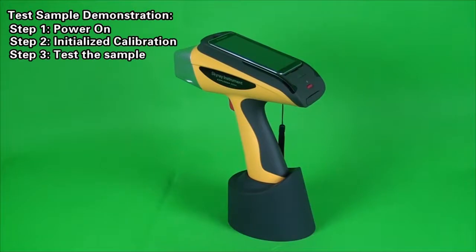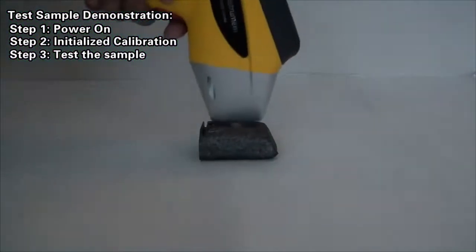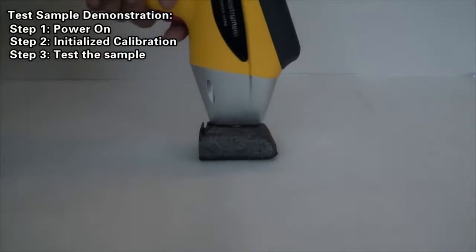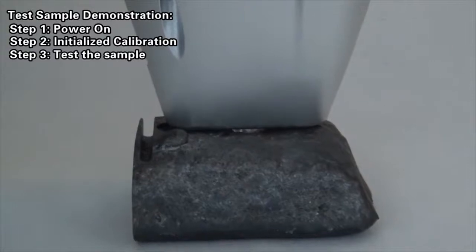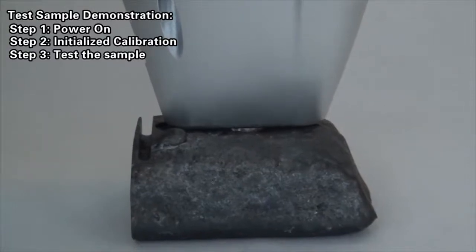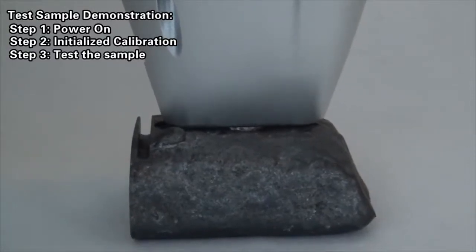Step 3: Test the sample. Attach the test terminal of instrument closely on surface of the sample to be tested. Pull the trigger to carry out the test of sample and keep squeezing the trigger until the test is over.